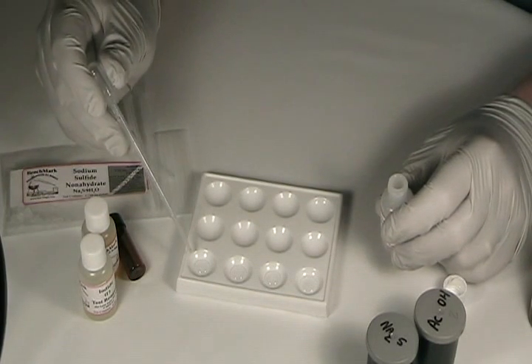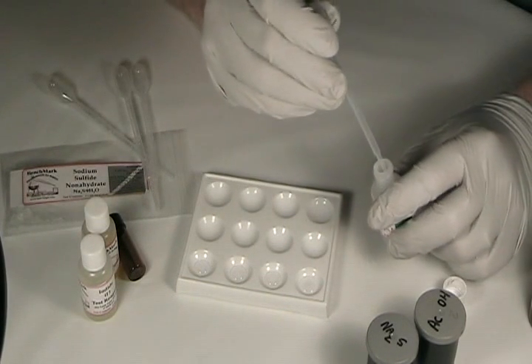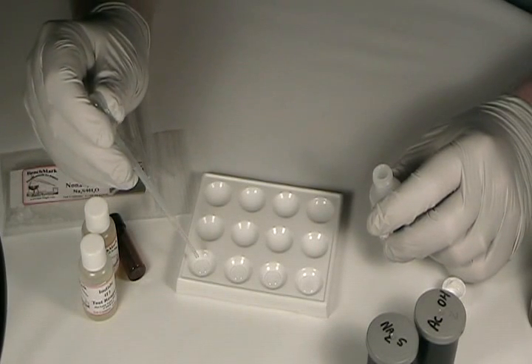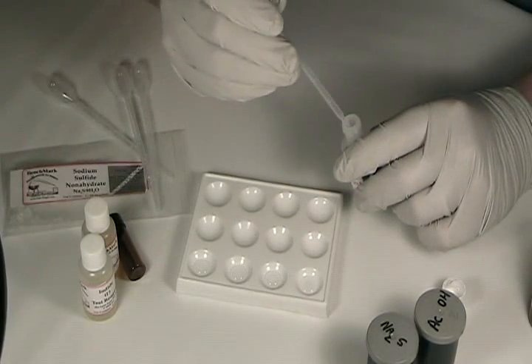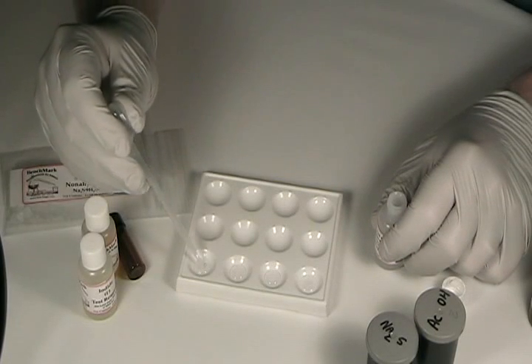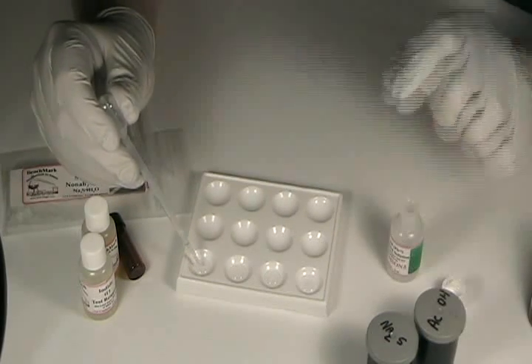I've already placed nine drops of plain water in each of these four front wells of the reaction plate. Now I'm going to withdraw just a small amount of the standard 50,000 parts per million lead and add one drop to the first well. I'll draw that up and expel it, swirl it around to mix it. The first well is now 5,000 parts per million lead.